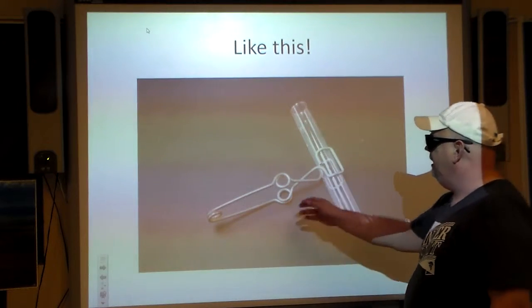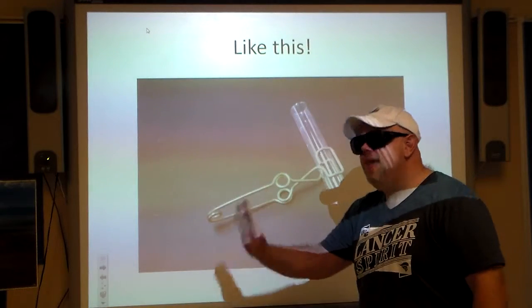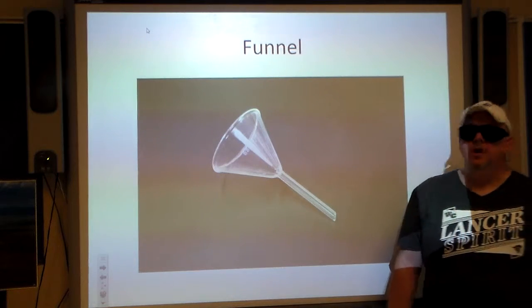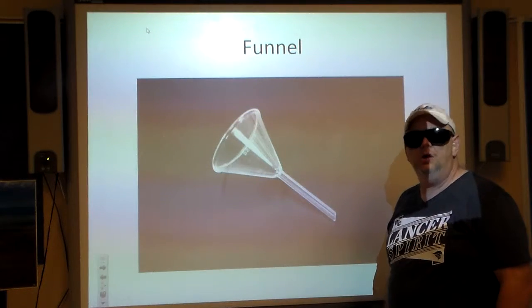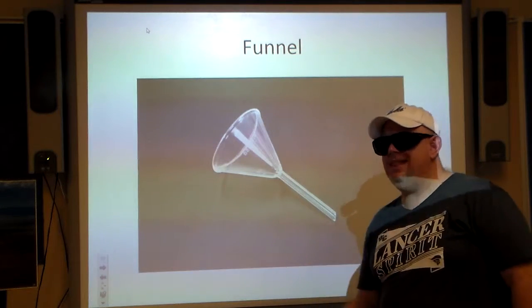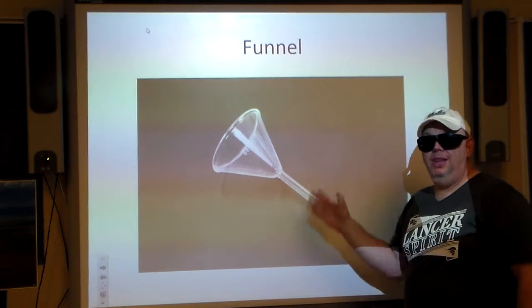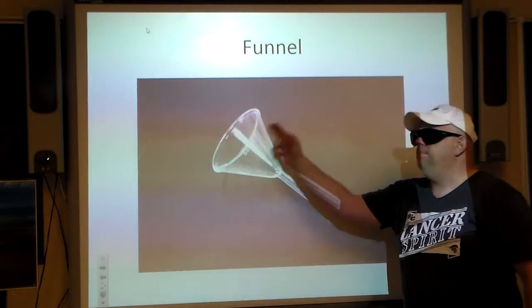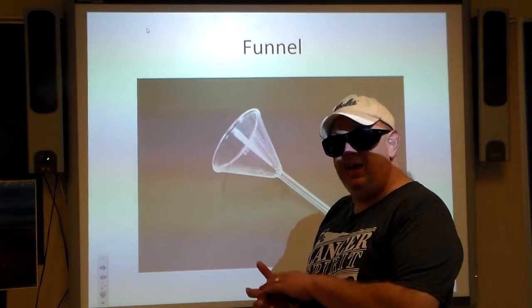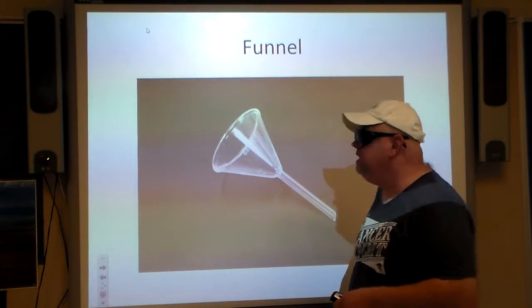Once it's clamped, all you've got to do is just pick it up — you don't need to squeeze it. That's the key thing. A funnel — some people might mistake this for a glass trumpet. Sometimes they're plastic, sometimes metal. We use it to make it easier to pour liquids into something. Sometimes we put in filter paper because we're trying to separate the liquid from some of the solid in a chemical solution.